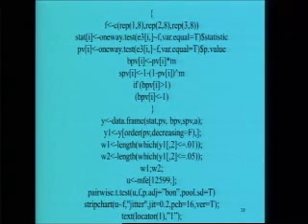So this is a set of commands which helps us to analyze such a huge dimensional data set and arrive at the aim of identifying only a handful of genes out of thousands and thousands of genes.